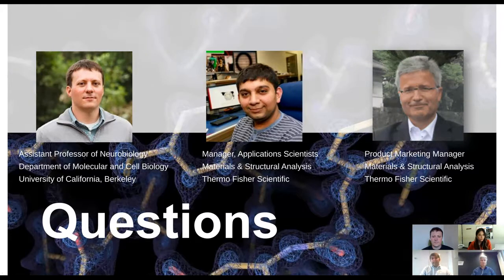So I would say anywhere between 2 and 2.5 angstroms, you start getting more accurate details. From 2.5 to 3 angstroms, you can still see how your ligand is bound and how it's interacting, with a little less accuracy. And from 3 angstroms to 4 angstroms, you can do some predictions there.